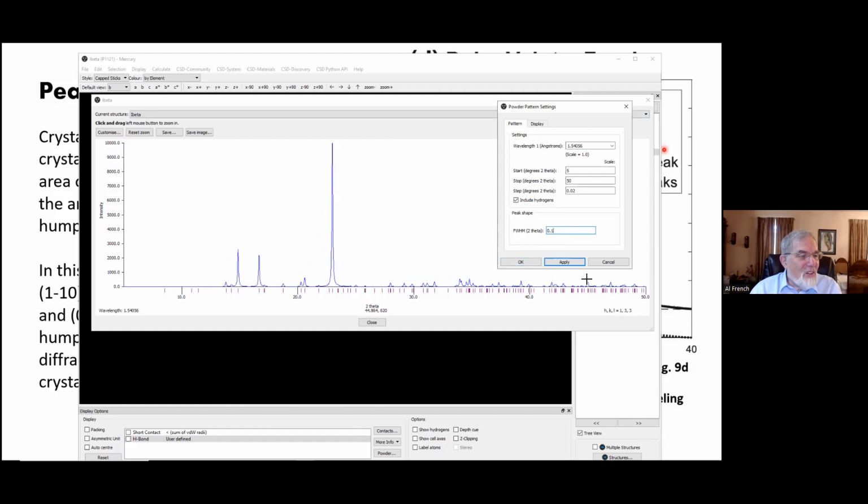and calculate the Segal crystallinity index for this pattern. Well, you see, here's the, this actually, there's a little peak. Segal didn't think there was a peak here, and you could almost call it insignificant. And it has a height here of, what does it say here? It says 243 counts out of a 10,000 count scale. So say it's 200, 10,000 minus 200 is 9,800. So that would be a 98% crystallinity value.